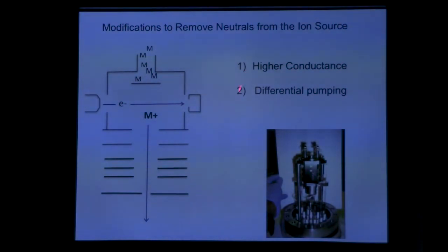And so a couple of modifications, just so that you're aware of them, they've kind of opened the source so that it's not so constraining and neutrals can escape. And then the important thing is that there's this differential pumping. And that's illustrated in the next slide.